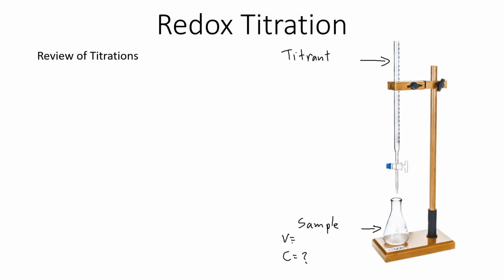So we need to know the volume, typically 10 milliliters because we measure it, but you're going to have to check your actual lab handout. And the titrant, well, typically we know the concentration of the titrant, right? Now it's going to be a slight problem in this lab.